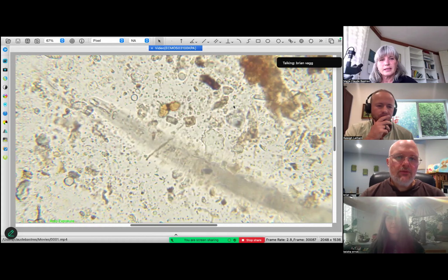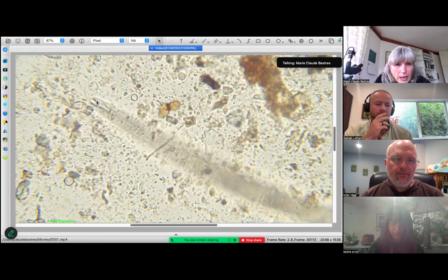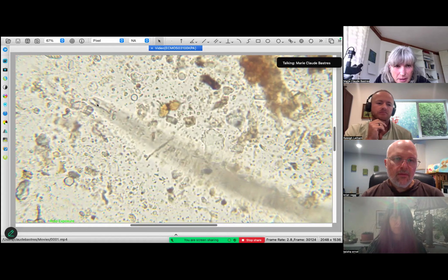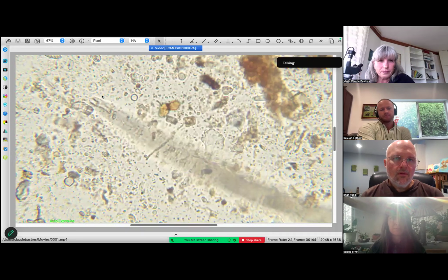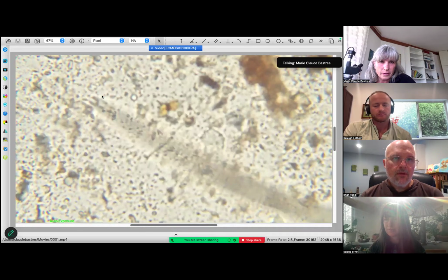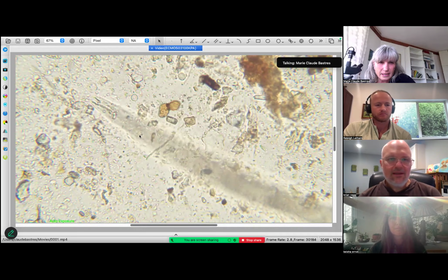Do you have a cursor you can put across that to show everybody what we're talking about? Right there, this is the mouth, and it is wide. Sometimes I have the feeling that it could be a carnivore because it has something here, and this is wide and straight. So sometimes I have my questions whether it is an omnivore or a predator. Predator, yeah, because of this little thing. I don't see the tooth, but I see this little thing. Usually the tooth is pretty prominent.